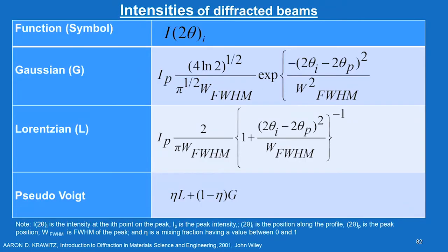Before that we would like to see some of the typical models for X-ray diffraction. It is very clear that if you want to quantify some of these effects, you need to model them first. Some of the models are represented in this table for X-ray diffraction, where the first column is the function and the second column is the intensity.